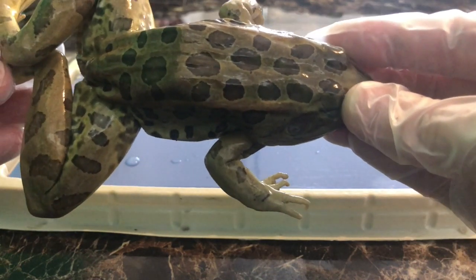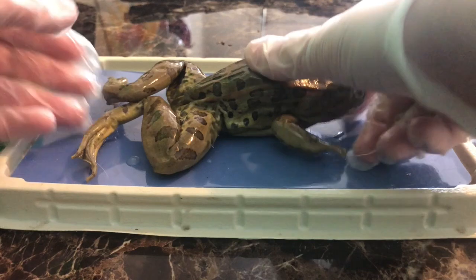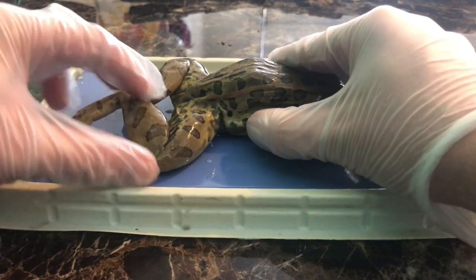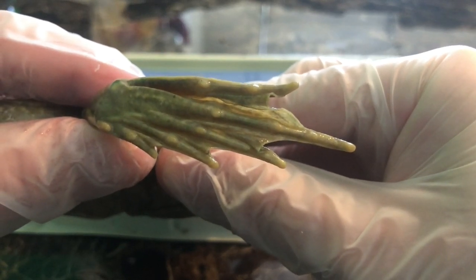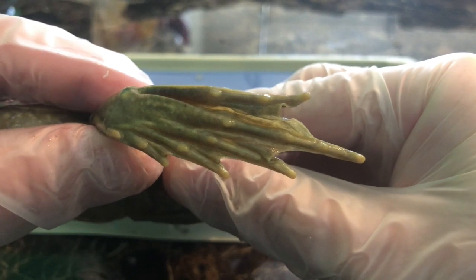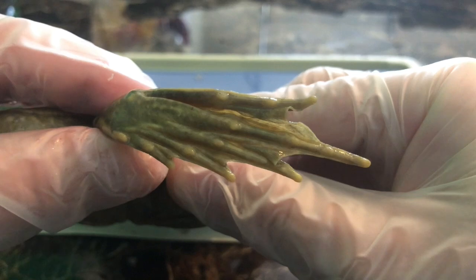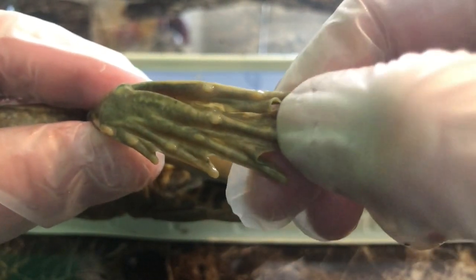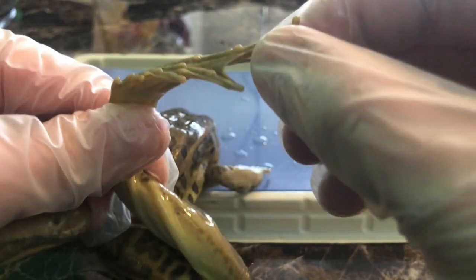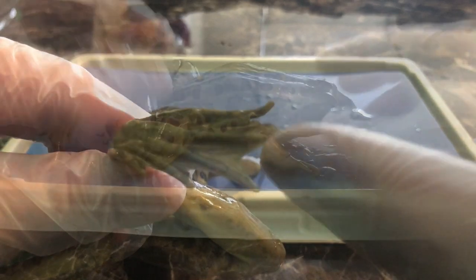Now we're going to look at the hind legs. The hind legs are the jumping legs and they are very strong. There are five toes, and there are little nodules or bumps on the bottom of the feet. You can see those little nodules, those little bumps, and you can also see the webbing between the toes.